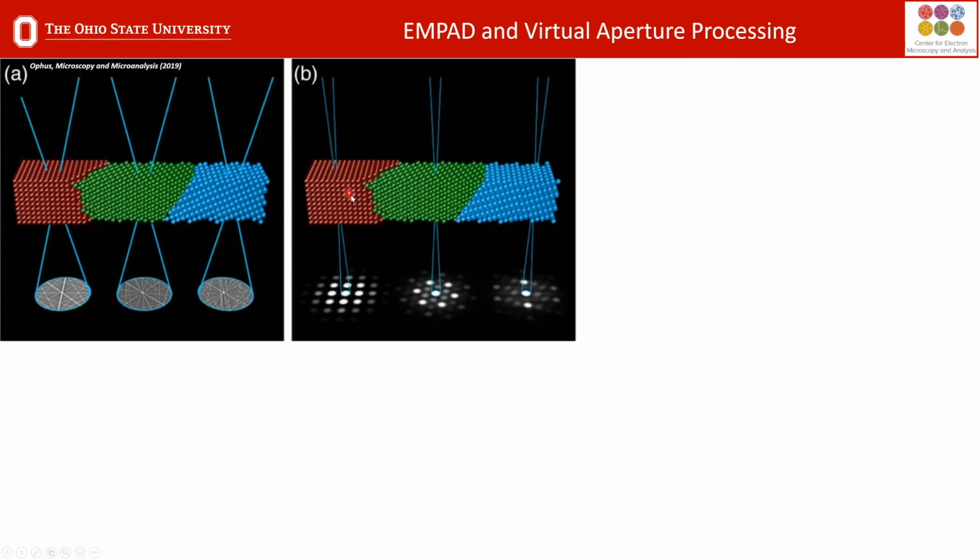But if I want to see in this red grain and know what comes from this diffracted intensity, I need to tilt the crystal so that this diffracted intensity comes to the middle of the sample, so it's on the optic axis. I'll then insert an aperture that will block out everything else that you're seeing in this diffracted region. And then I'll just use the intensity coming from this one reflection to produce an image. And that's a very powerful technique. That's what we've used since the 60s to characterize dislocations, to look at what different phases are present in given diffraction spots. And as you change your crystal orientation, you start to see how this will change, right? And as you're more off zone, you tend to get only 2 because of the reduction in symmetry, right?